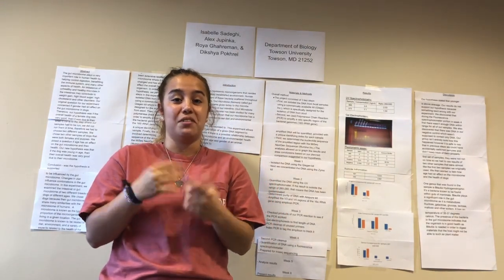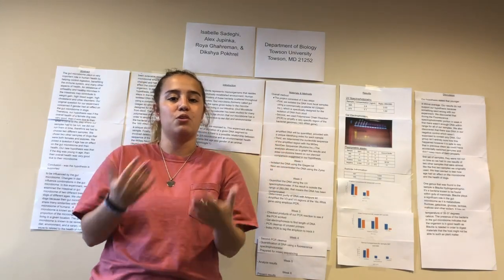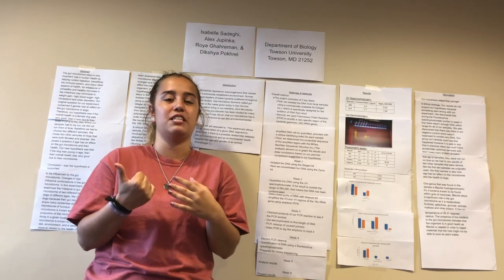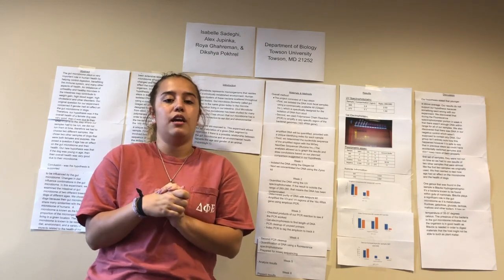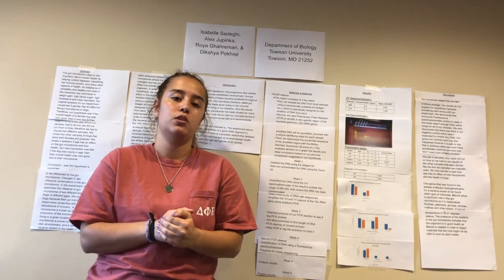So discussing the number of successful reads in each of the animals compared, there were no successful reads. Unfortunately, there were no successful reads to compare the animals and do analysis on, and there wasn't enough concentration of DNA to get a proper read of our samples.